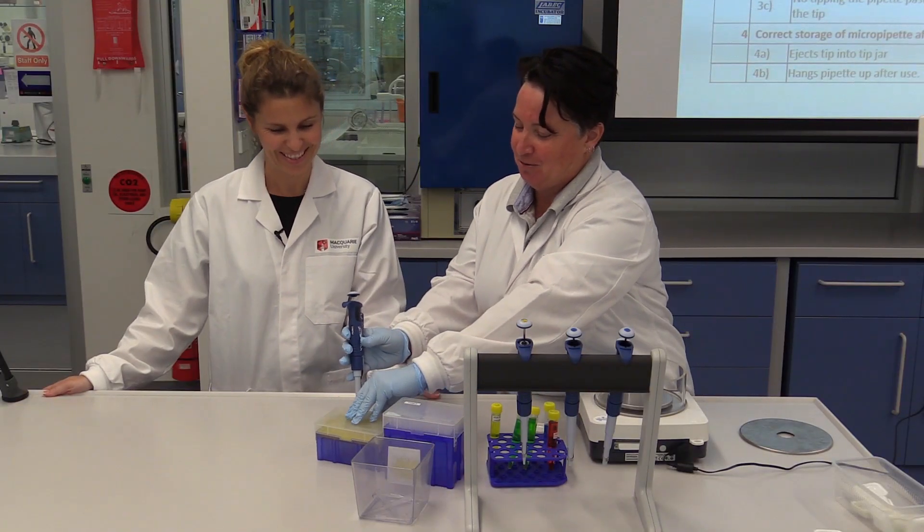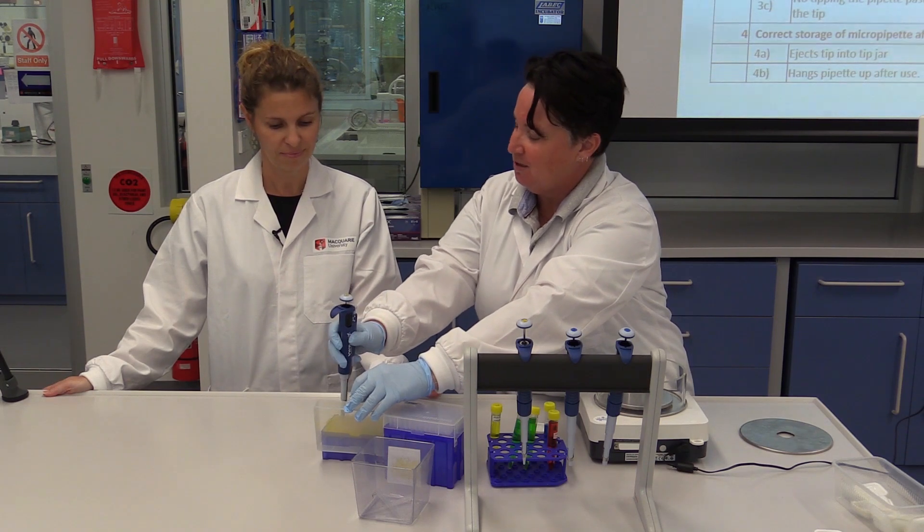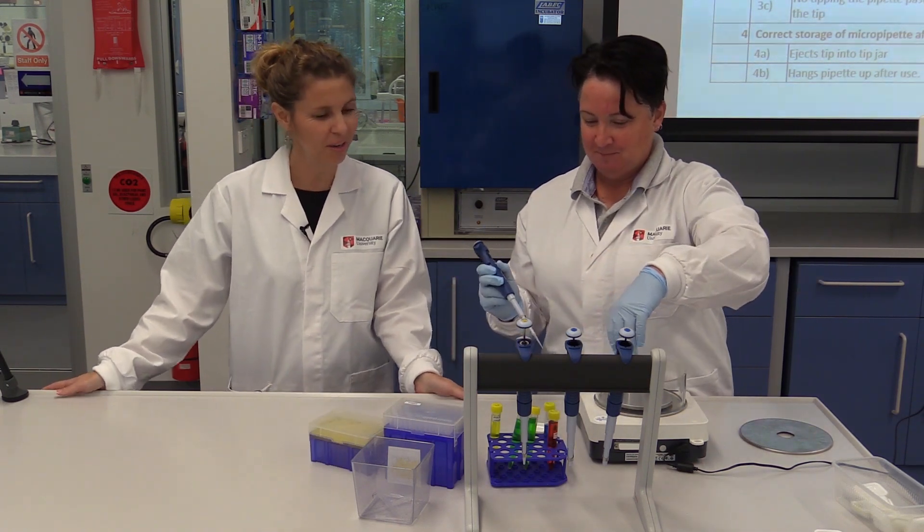I've got to take the right tip. So, I'm going for — because it's yellow on top, I know the trick that it's a yellow tip. Very good. You're much better than me.